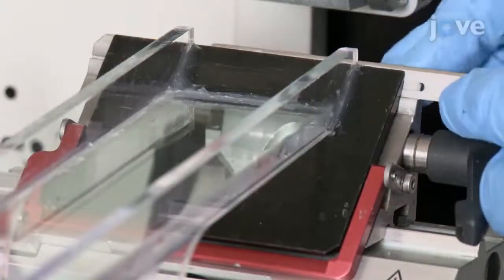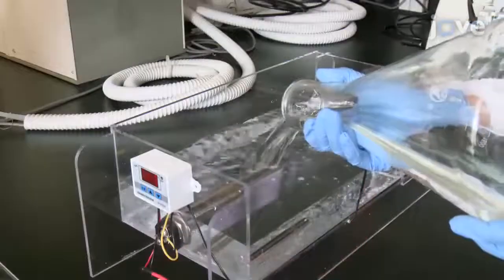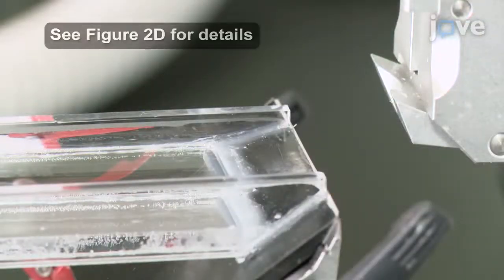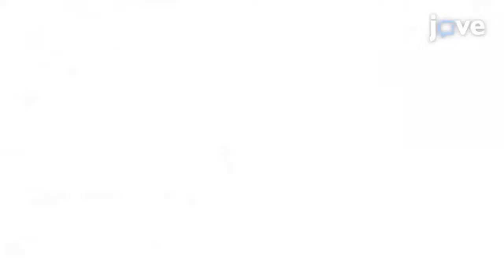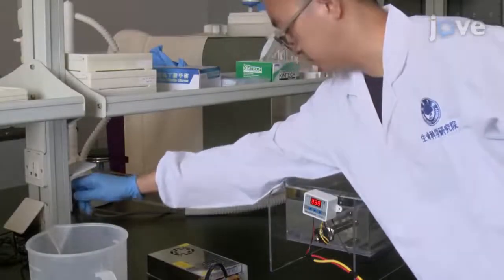The next day, install the blade in the blade holder. Add water to the water bath, making sure that the water surface just touches the top of the blade. After performing conventional paraffin sectioning, turn on the equipment to begin improved paraffin sectioning.